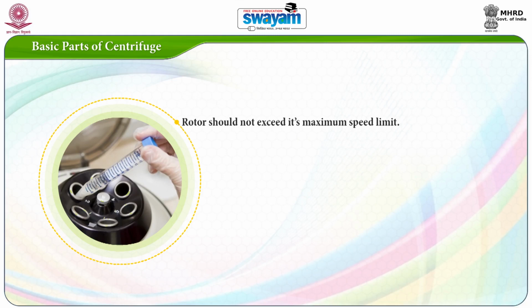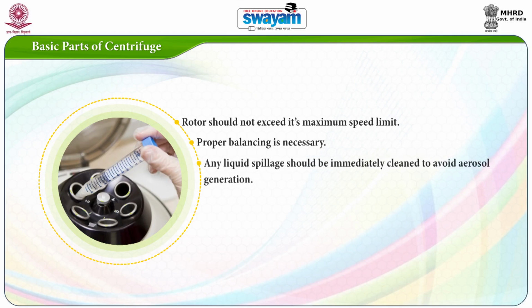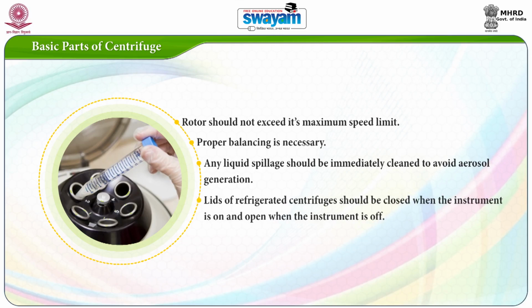Whenever you are doing centrifugation, you should properly balance the centrifugation tubes, which I will show you in an animation. During centrifugation, there is a chance of liquid spillage inside the centrifuge. That should be avoided. Why? If there is liquid spillage during the centrifugation process, there is formation of aerosol. In any laboratory, there will be these aerosols. These aerosols will carry infectious particles, fungi, bacteria and all with them.